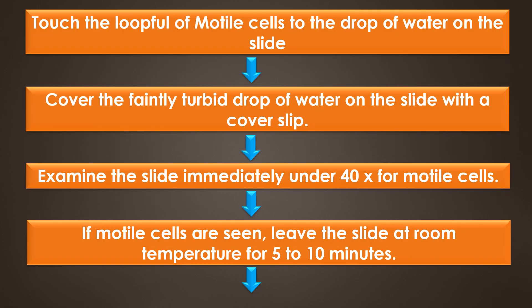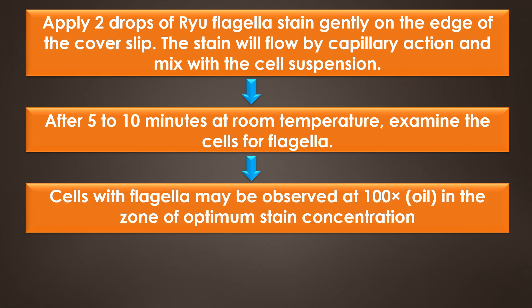After that, touch the loopful of motile cells to the drop of water on the slide and cover the faintly turbid drop of water on the slide with a coverslip. A proper wet mount has barely enough liquid to fill the space under a coverslip, and small air spaces around the edge are preferable. Examine the slide immediately under 40x for motile cells. If motile cells are seen, leave the slide at room temperature for 5 to 10 minutes. Then apply 2 drops of Ryu flagella stain gently on the edge of the coverslip; the stain will flow by capillary action and mix with the cell suspension.